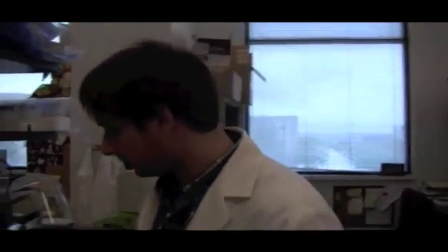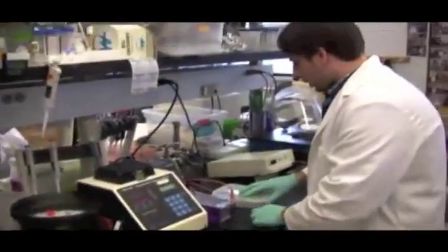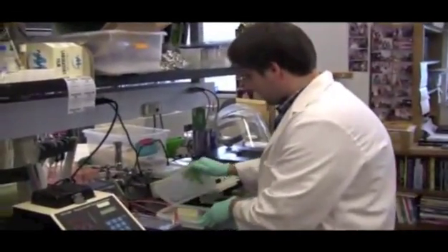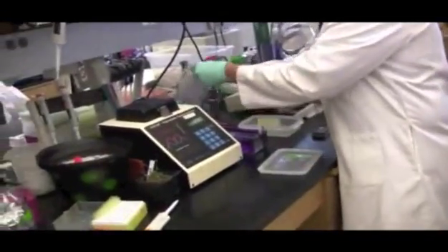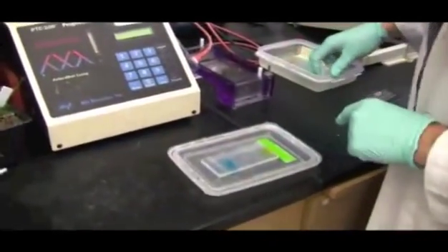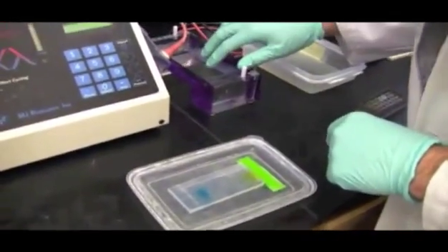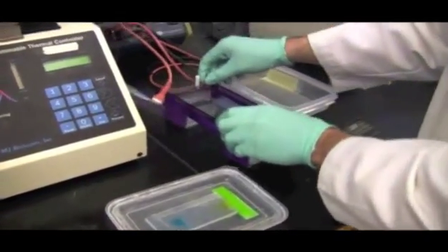And are bigger pieces of DNA going to go through faster, or are smaller pieces of DNA going to go through faster? So I'm going to give you guys a quick second to answer that, and I'm going to take care of my gel real quick. This will be important in a second. Cool. So I'll bring this out here so we can see it a bit better.